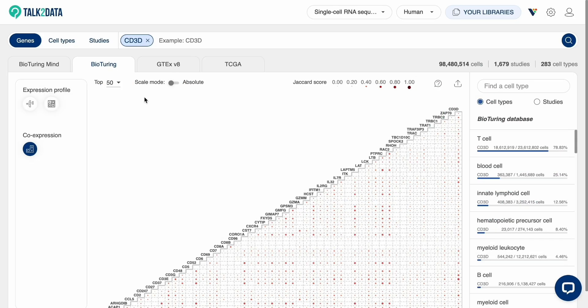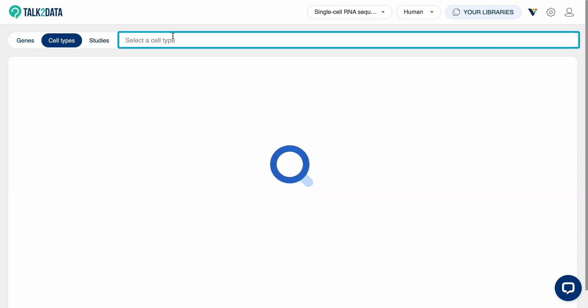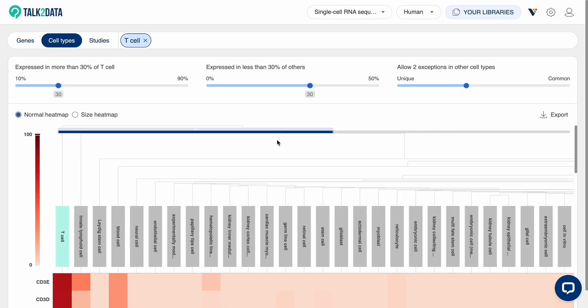Next is Cell Type Search. This tool allows you to query for potential markers of a cell type. Search for the cell type using the search bar. Here is a heatmap displaying genes specifically expressed in the queried cell type.